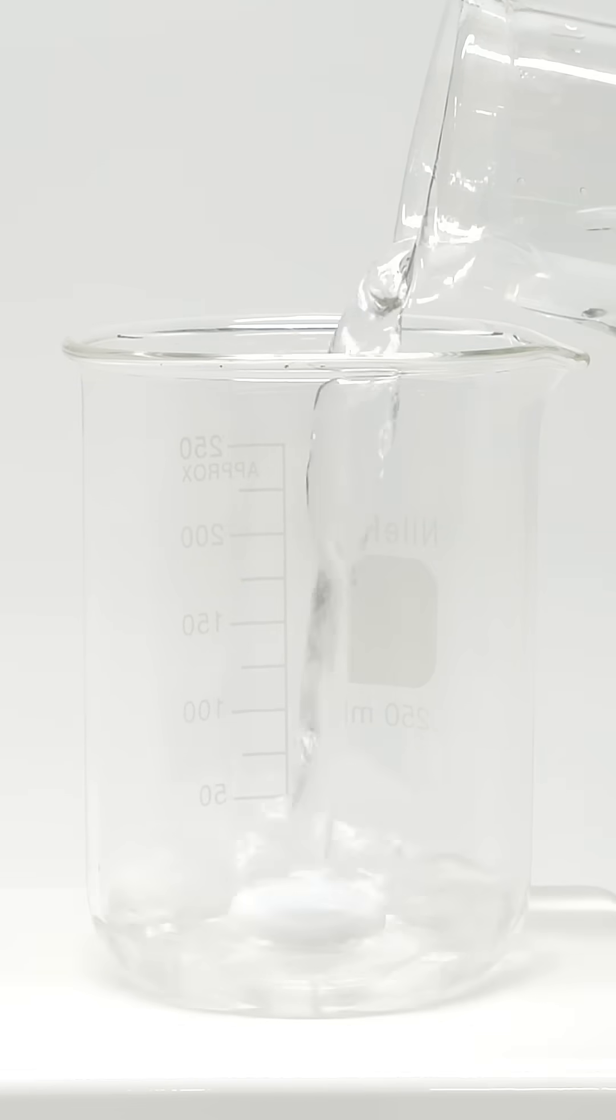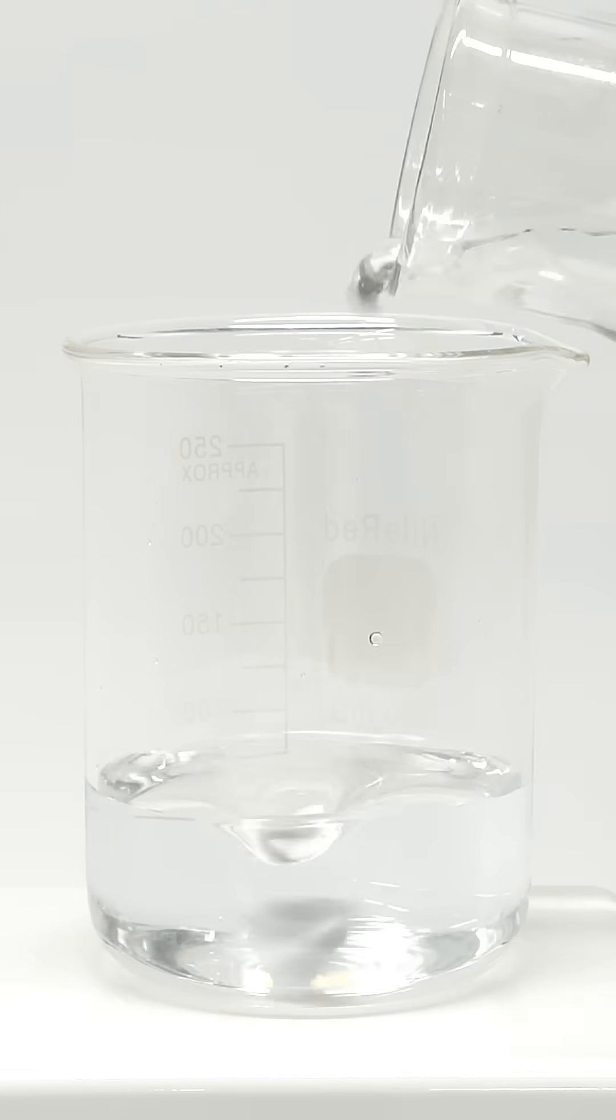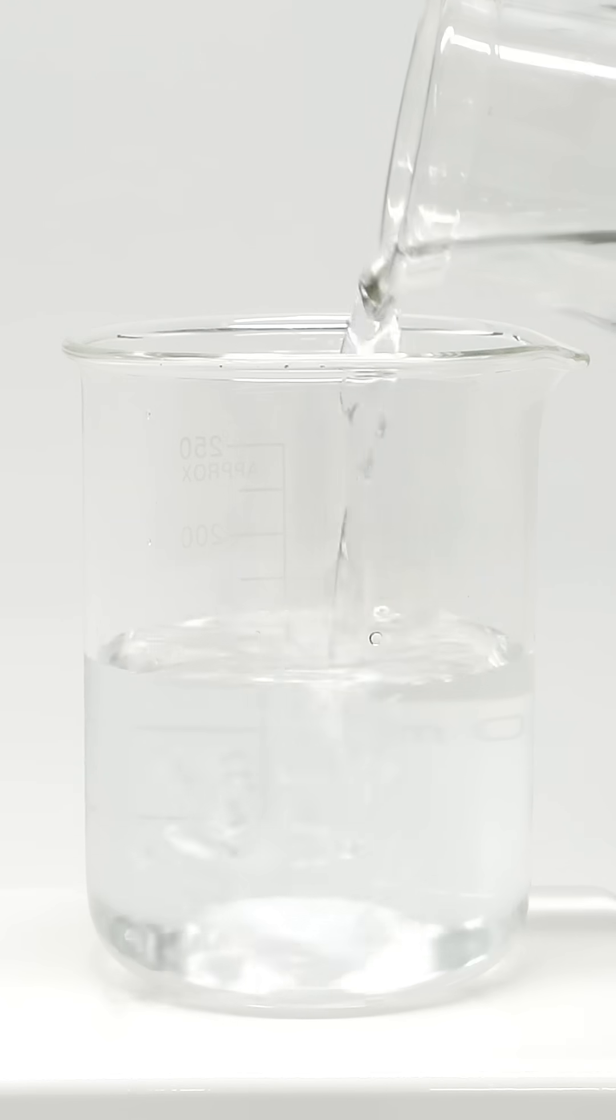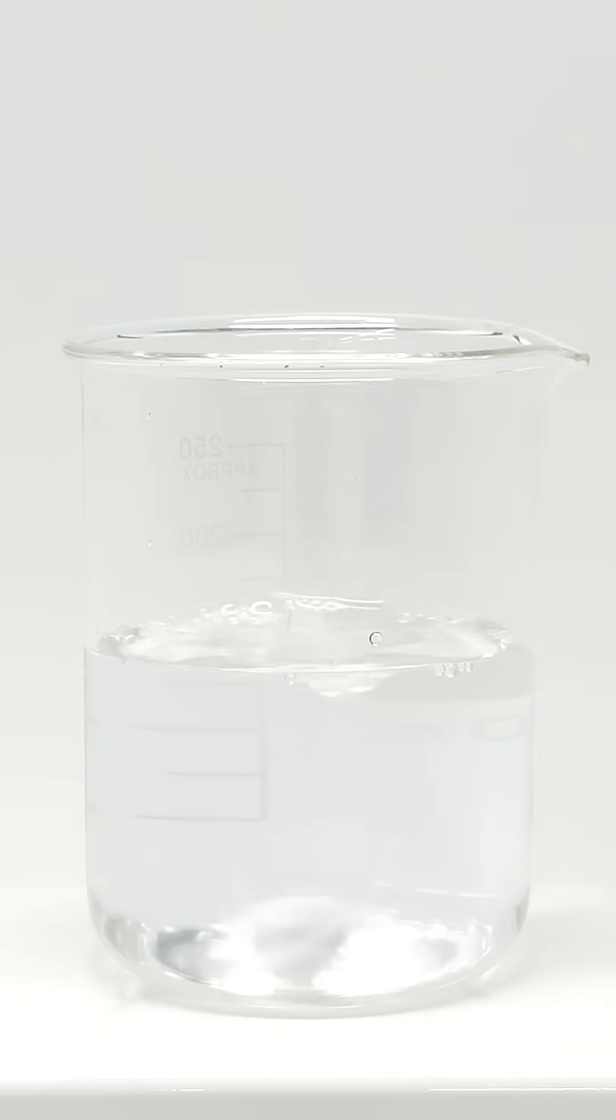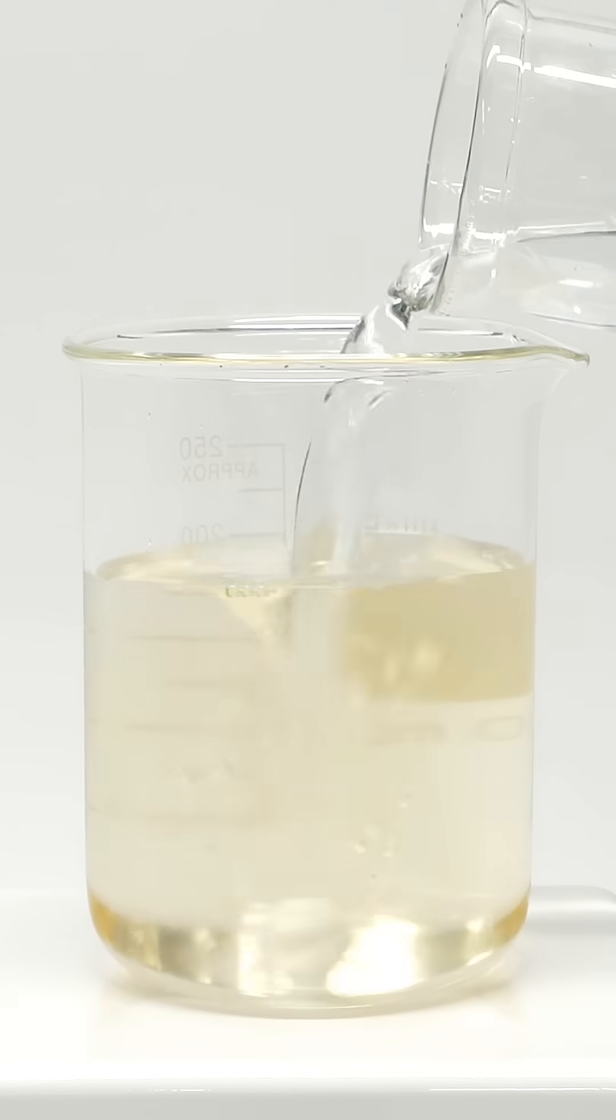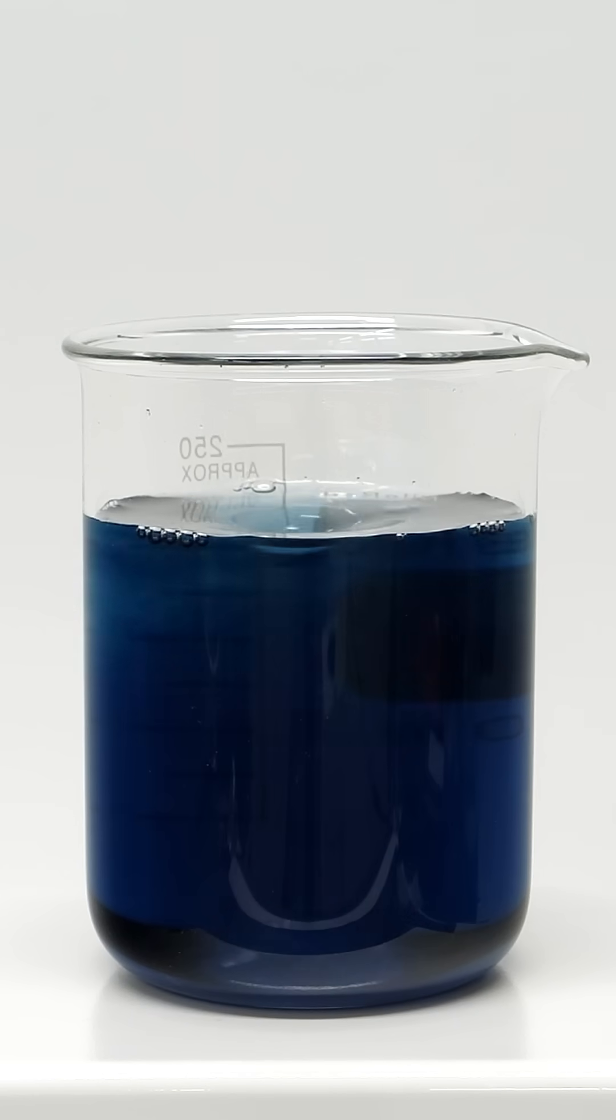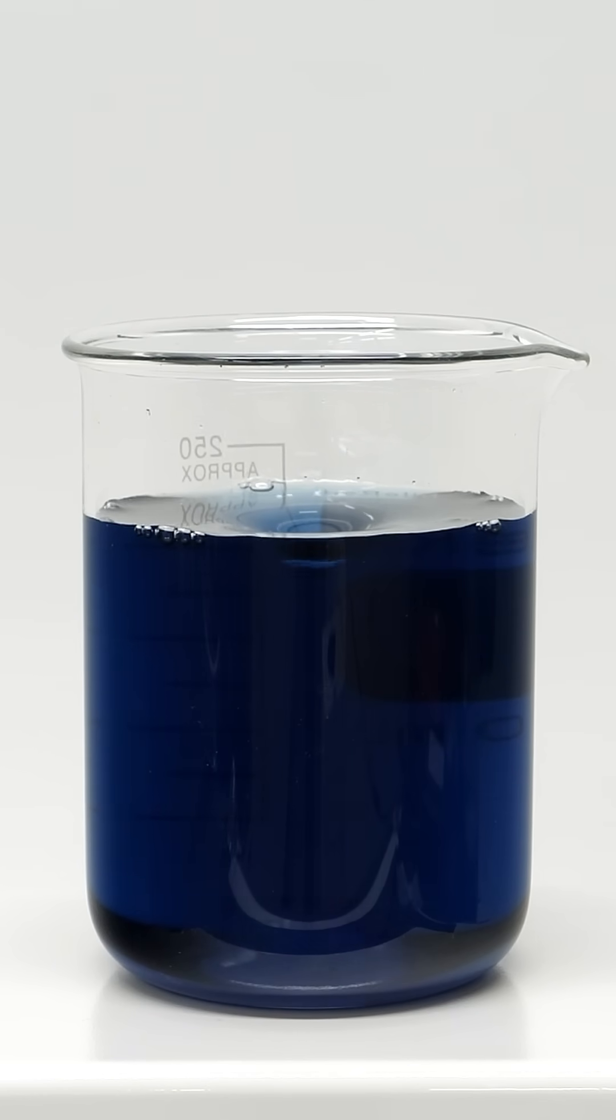Now, all I need to do is combine them together in roughly equal amounts. The moment solution C is added, it starts changing colors, and then suddenly, it turns almost black.